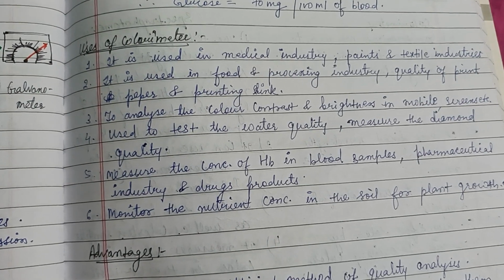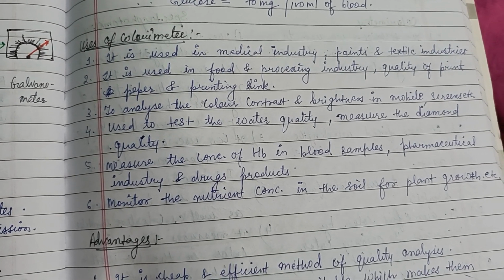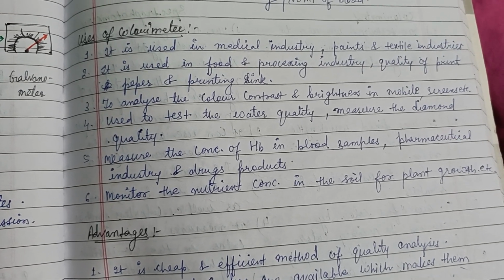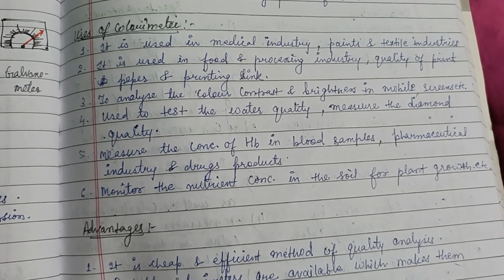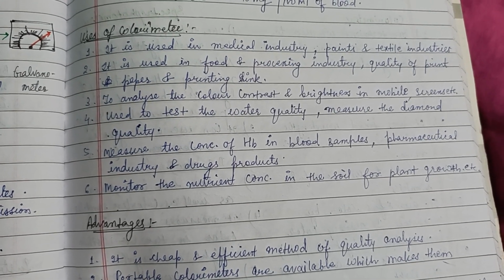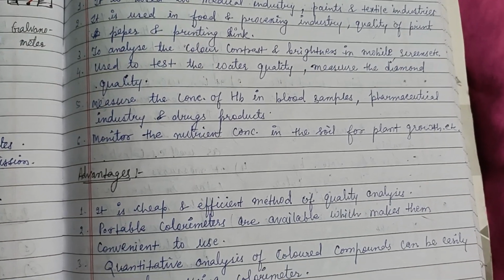Uses of the colorimeter: it is used in medical industries, paints, print, paper and printing inks, textile industries, color contrast and brightness of mobile screens, to test the water quality, measure the diamond quality, measure the concentration of hemoglobin in blood samples, pharmaceutical industries and drug products, and to monitor the nutrient concentration in the soil for plant growth.